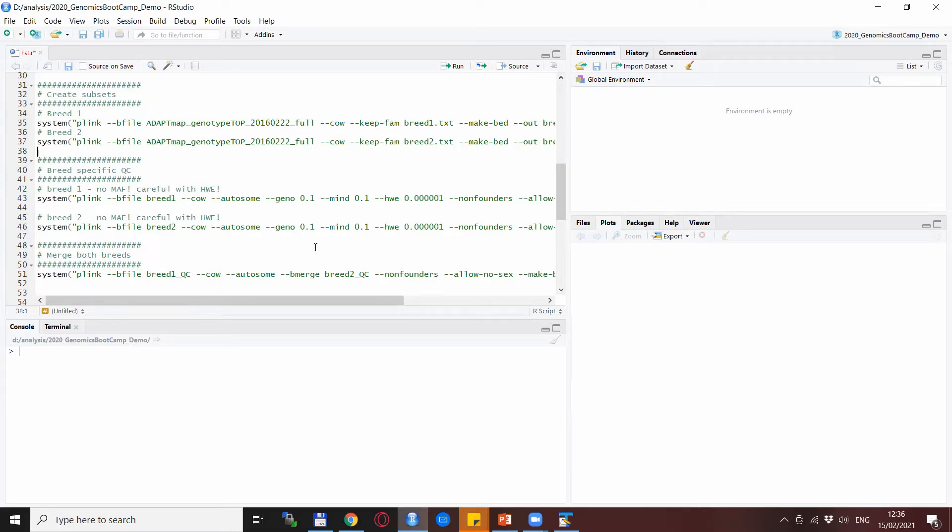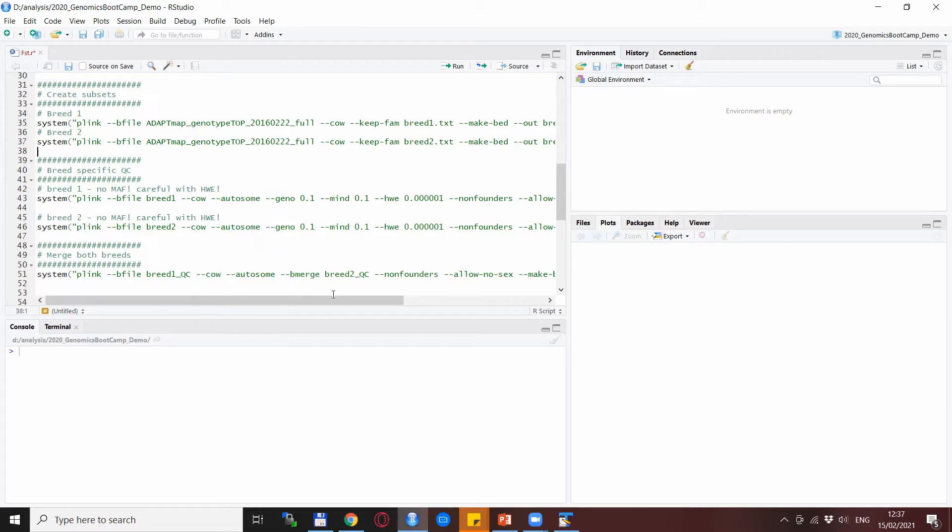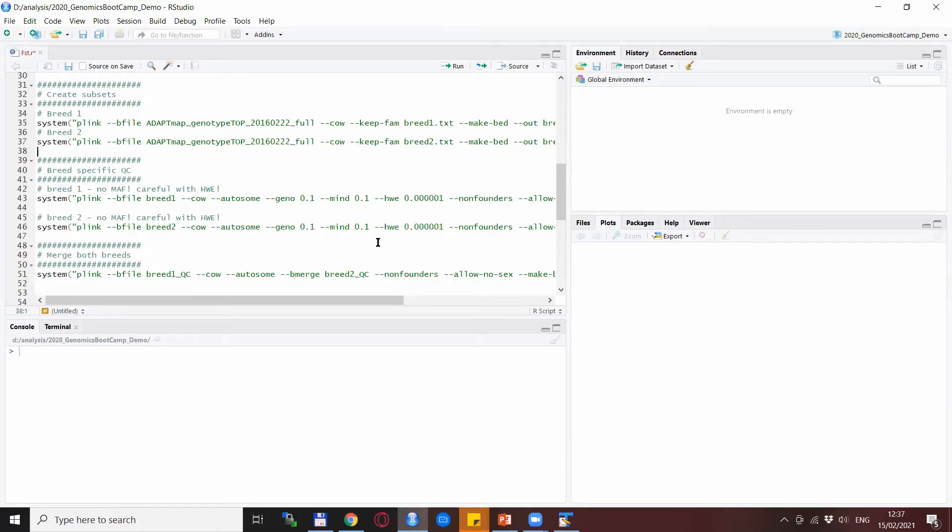At the time of making this video there is no separate video on merging data with Plink, but I plan to do that, so when it's done it will be linked to this video. For now, we are okay with a short description that basically we are using the input file as breed one QC and then we use the --bmerge statement with the second file that we want to merge together.